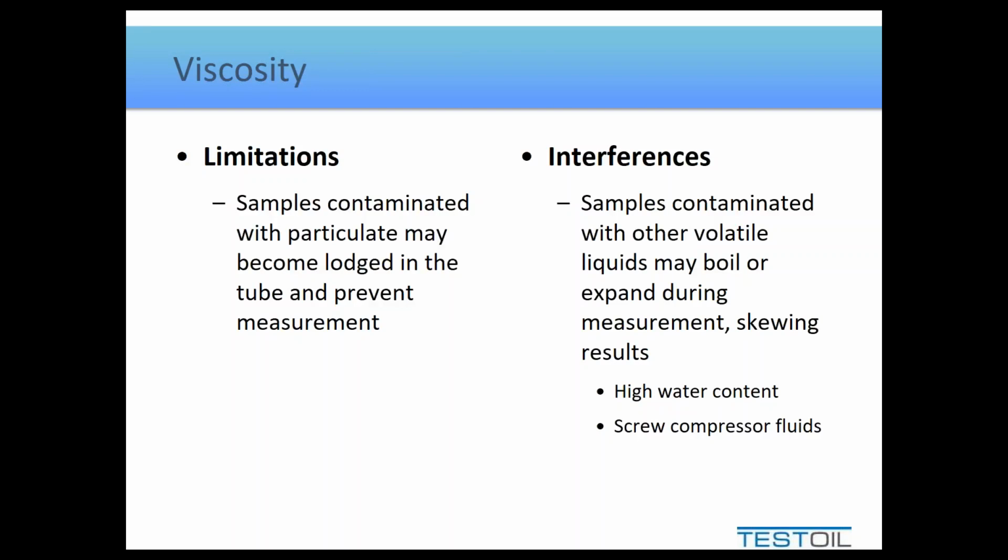So I'm not a fan of degassing, but it doesn't make me right. If you would like to degas samples so you can confirm the lubricant does look correct, there are a couple of different methods of doing it. One method is to simply let the sample sit. If you let the sample sit for the better part of a week, most of the gases will escape on their own. As long as you leave the lid loose, they'll vent to atmosphere.